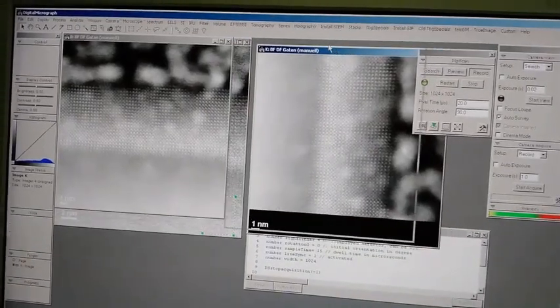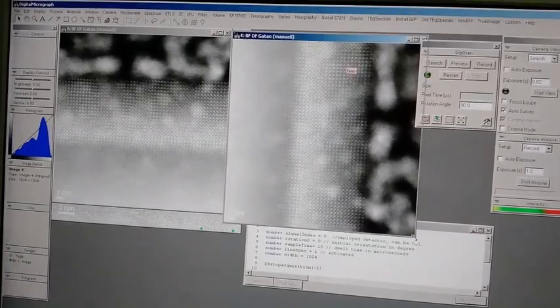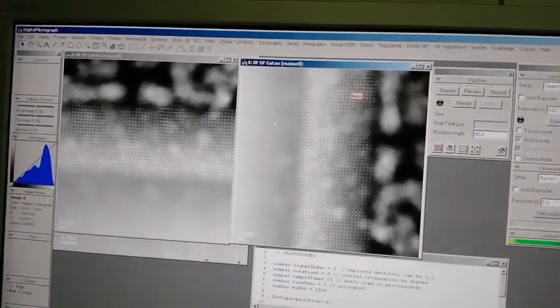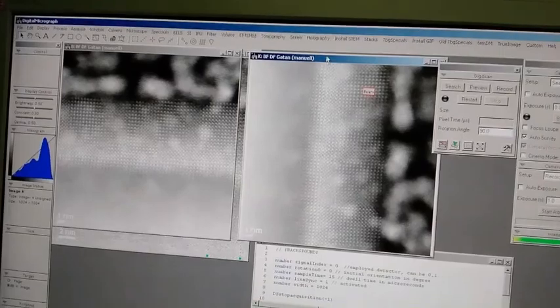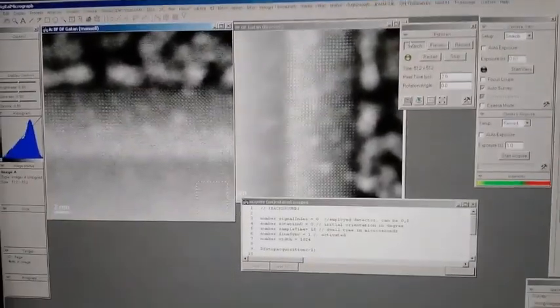In summary, at the end, we will obtain a couple of images strongly distorted in mutually perpendicular directions. So there is great hope that having them both, we can reconstruct the true image. We can also do it differently.